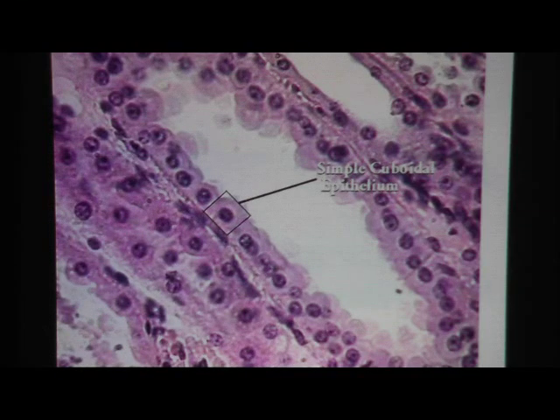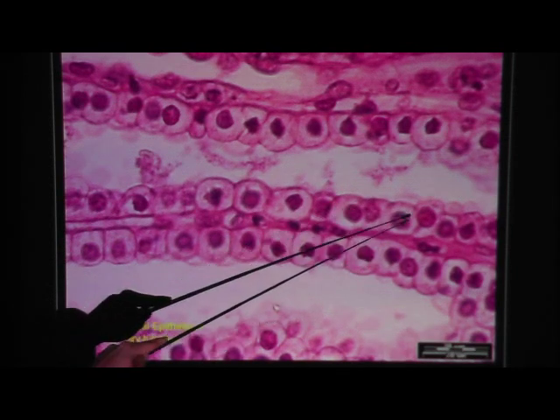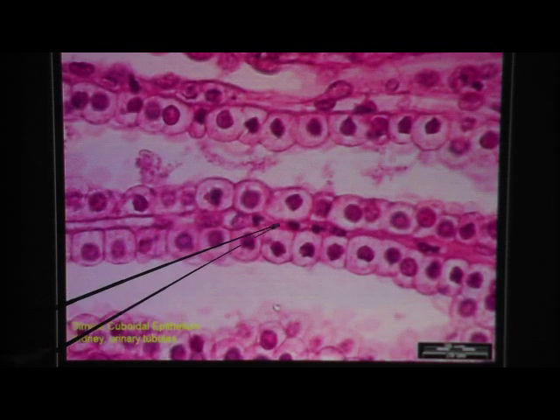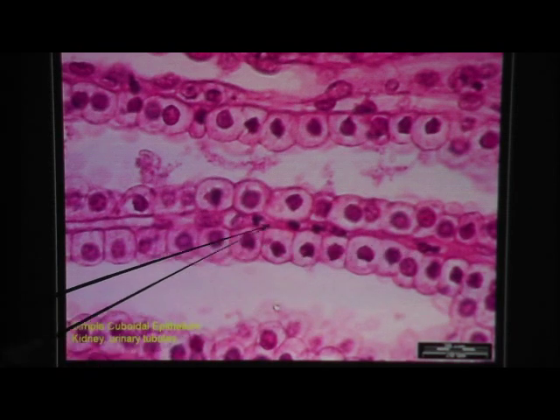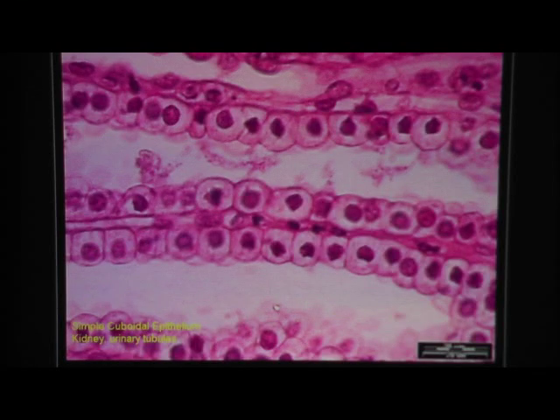Nuclei and cytoplasm are visible. Here's another kidney tubule cut lengthwise, running across the board — all of this is one cell thick. There's another one-cell-thick layer for a different tube. The stuff in between is not epithelium, so you cannot call it two layers thick. The shape is cuboidal.